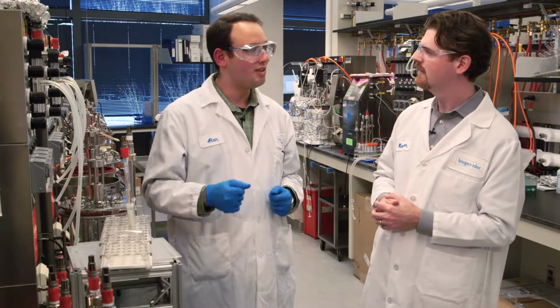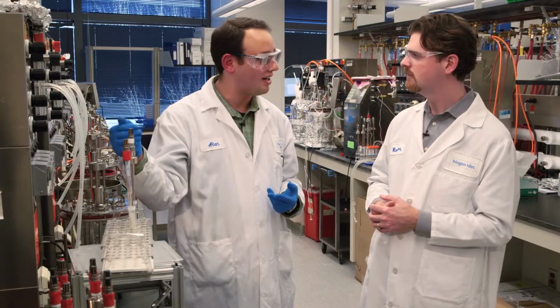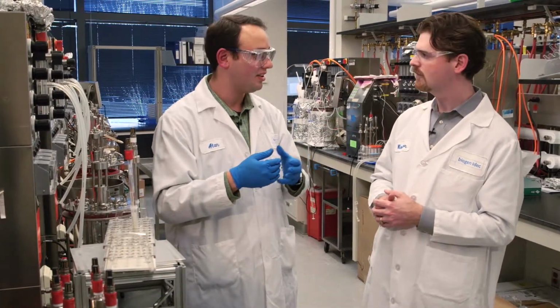So actually operating the system requires a control tower. The control tower will have things like your motor, your temperature probe that you'll actually have to insert as well, which does not go through the autoclave, as well as your electrical connections to your pH and your dissolved oxygen probe. All those sensors will go back to a computer where you'll have a set point and something that will respond to that set point. So once the cells are in there, you've got all your control loops running, and you have to come back periodically to monitor them and make sure that it's going according to plan.